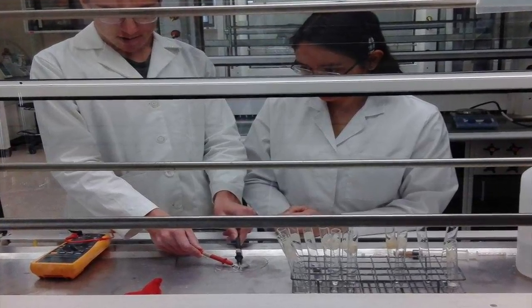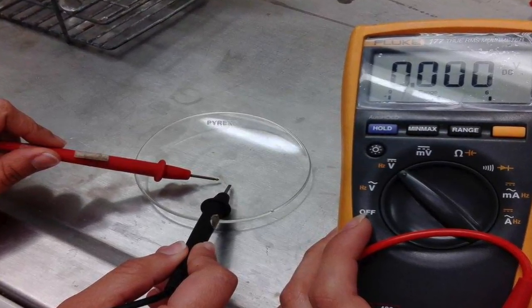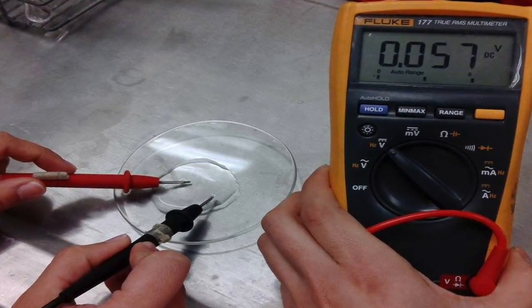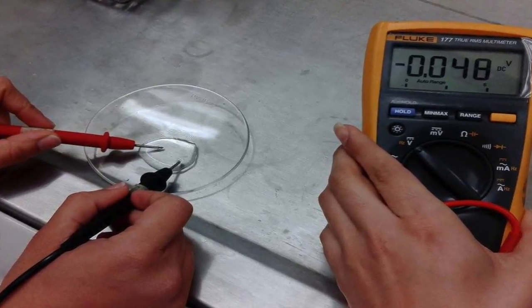After that, the team took solid compounds and liquid compounds and added 1 milliliter of water in order to check the voltage and see if they were conductors or not.